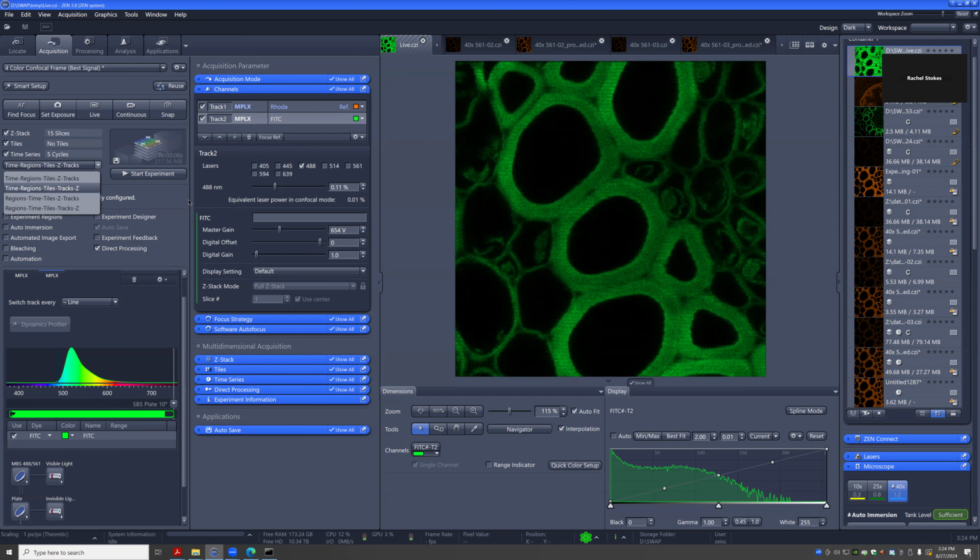That also ties to the focus map, because if that center is moving, it would have to move to a different plane every time if it did tile first. It would take a lot more time versus just going to one spot, going through the Z, and then moving to the next one. So that's the default way it solves it. If you are on a tile, I think we have it checked right here.